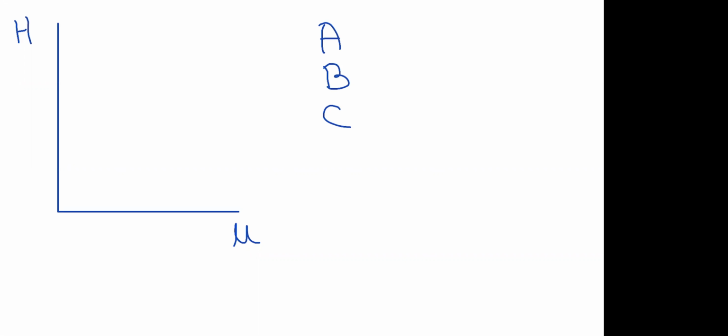So first, we could think, how does the eddy diffusion influence the plate height with the flow rate? The eddy diffusion captures the fact that different molecules of the same compound travel slightly different routes through the column. And this is actually something that is flow rate independent. So independent of the flow rate, the eddy diffusion coefficient is the same for the compounds.